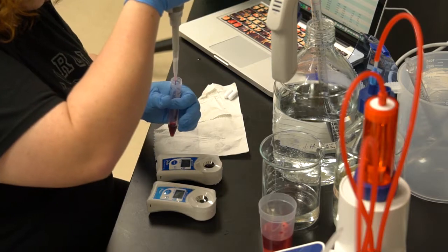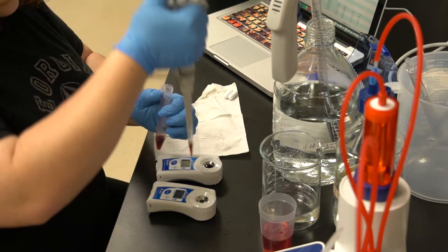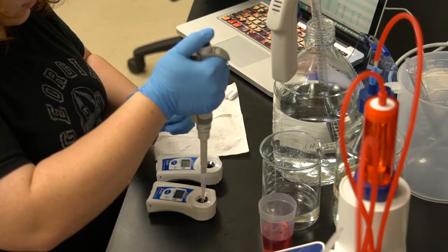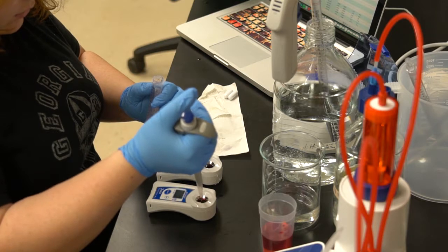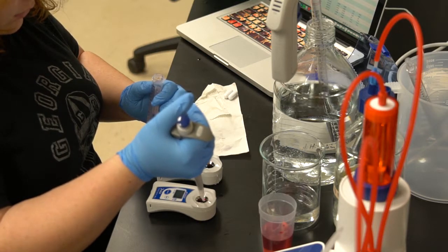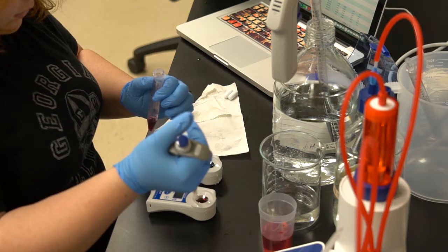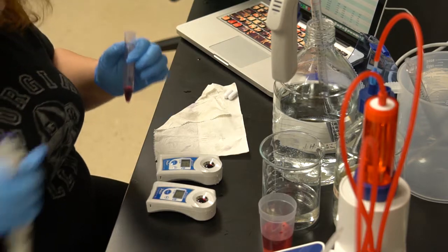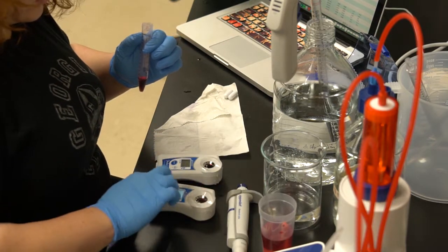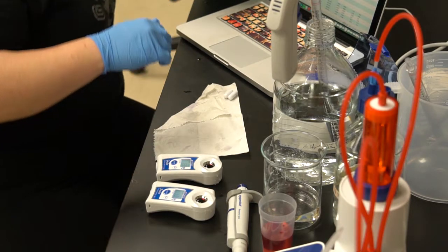Using a pocket refractometer shown here is a quick and easy way to estimate sugar content in a blueberry juice sample. The refractometer is designed to measure the degree of light refraction as a beam of light bends when passing through a solution. This is known as the refractive index and can estimate the amount of solutes dissolved. Sugar is the predominant soluble solid found in fruit juices among phenolic compounds, amino acids, and organic acids.